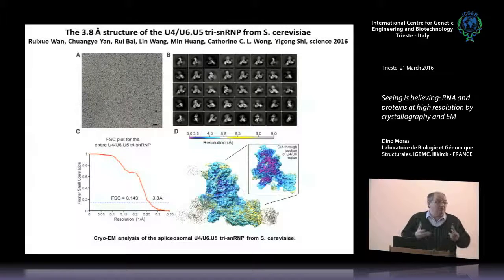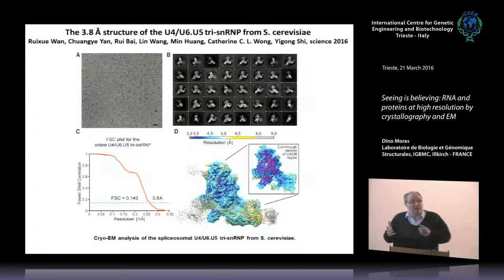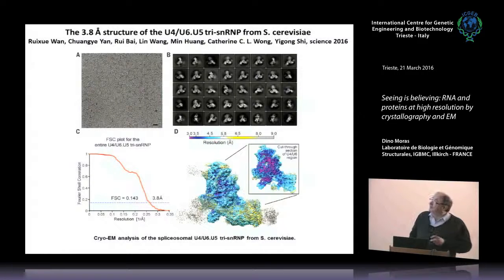That was a very challenging attempt; attempts had been made to crystallize it. But against the odds, and for reasons that we can discuss afterwards, no. The ribosome could be solved by crystallography, which was one of the major results. The spliceosome could not, because of flexibility, mobility, and the difficulty of assembling a functional molecule. The spliceosome is made of several proteins and RNA.